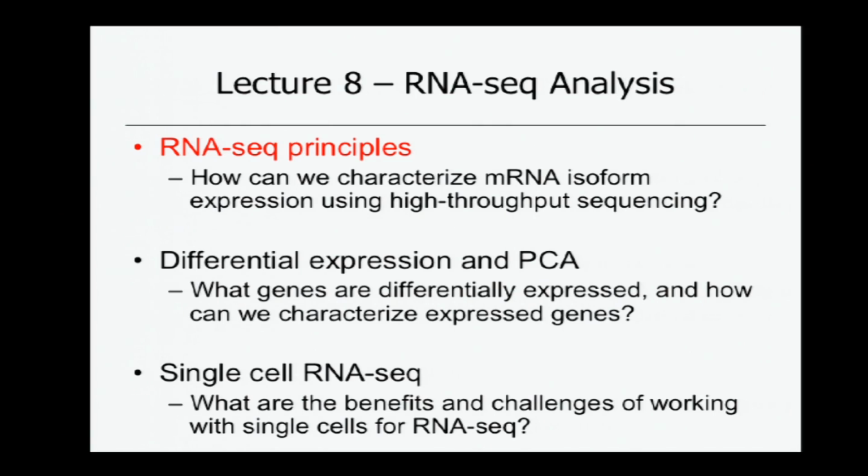And we'll talk first about RNA-seq principles. We'll then talk about how to take the data we learn from RNA-seq and analyze it using tools for characterizing differential gene expression and principal component analysis. And finally, we'll talk about single-cell RNA-seq, which is a very important and growing area of scientific inquiry.